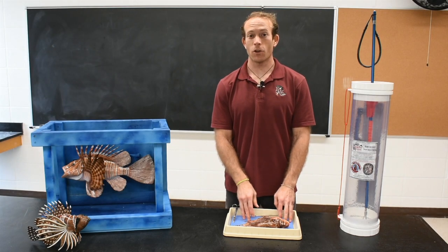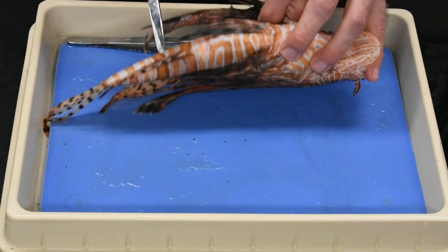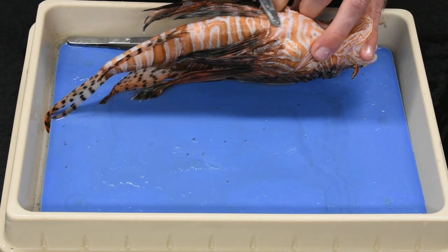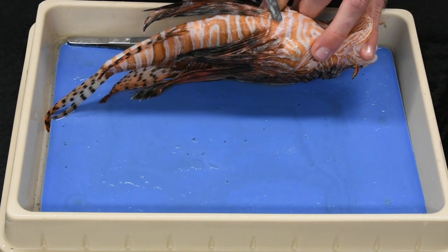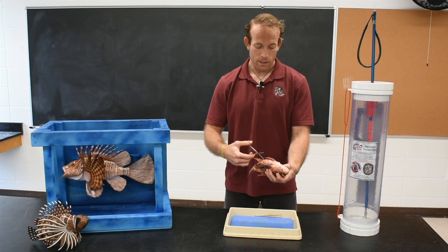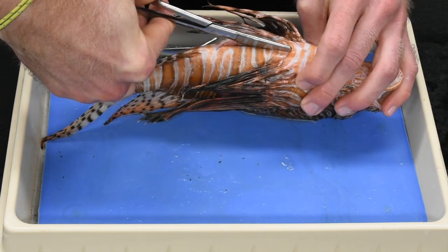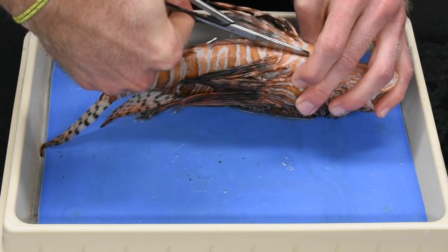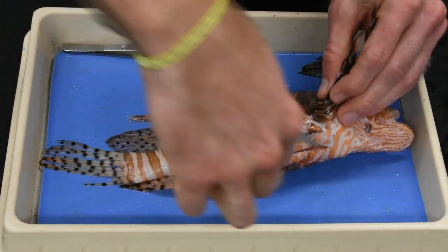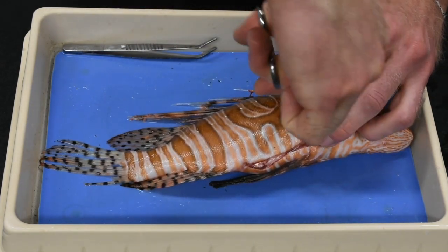Now we're going to take a look at the internal anatomy of the lionfish. To do that, I am going to make a cut from the urogenital opening up to this area where there is a pelvic girdle — a bone between the two pelvic fins. I'll cut close to the skin so I don't damage any of the internal organs, then crack the pelvic girdle and make another cut up to the dorsal ridge.